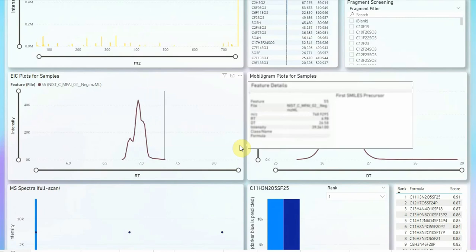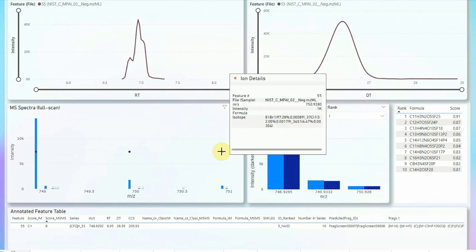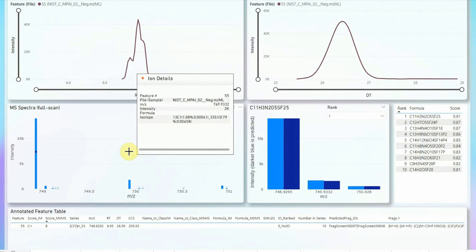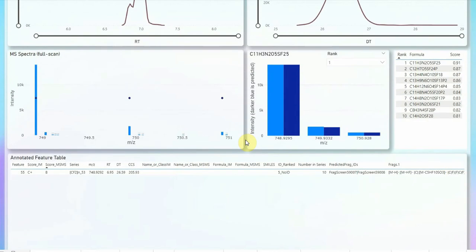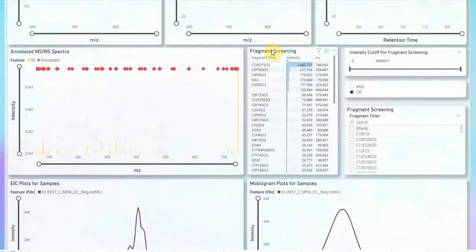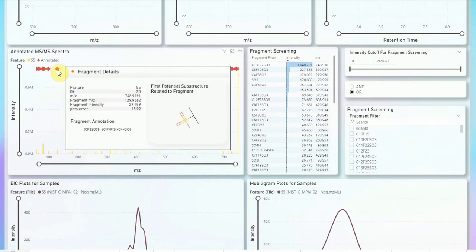It's an unknown species, but we do have isotopic information here, and then we have formula matches. For example, you can see that all the formula matches have sulfur because of this sulfur related peak over here at about 4% compared to just the C13 peak. And so that's some idea. Then you can also see with the fragmentation that it gives you substructures of what that molecule could be.